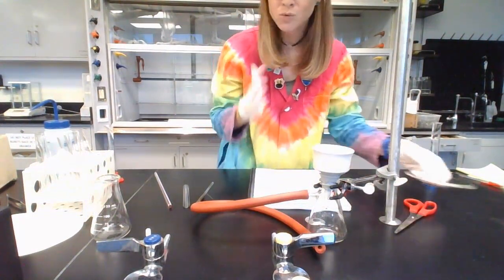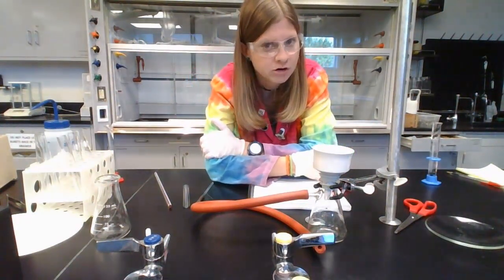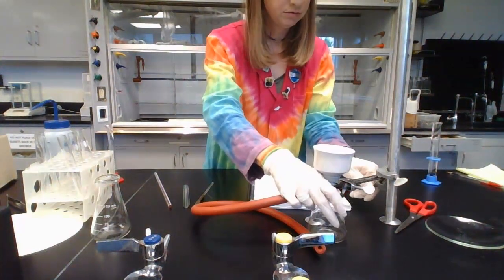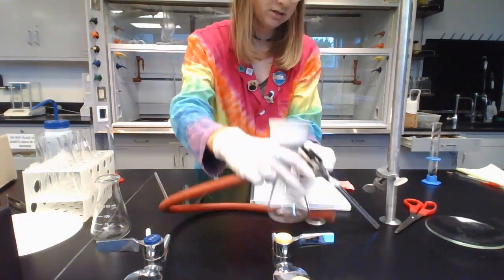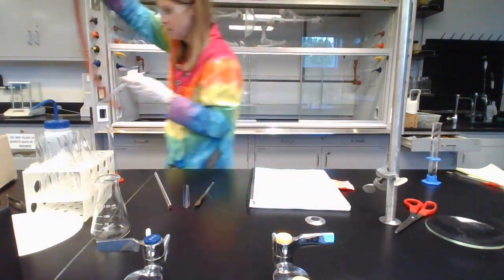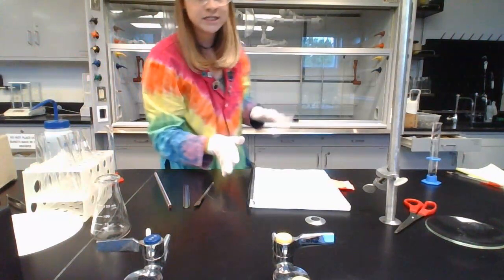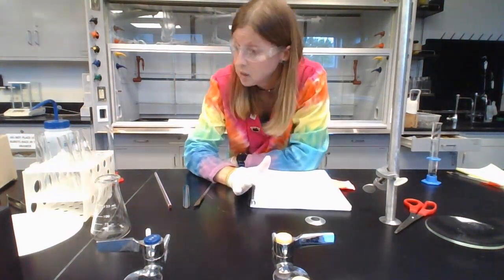Okay. So while that's happening, there's one test we haven't even started yet, which is the thin layer chromatography. Okay, the TLC. So let's talk about how to set that up. I'm going to move this stuff out of the way. Okay. Oops, Buchner funnel. Stop it. Good news is we did TLC back in the chromatography lab. So you've done this before. So as we go through this, I'm hoping it's familiar.